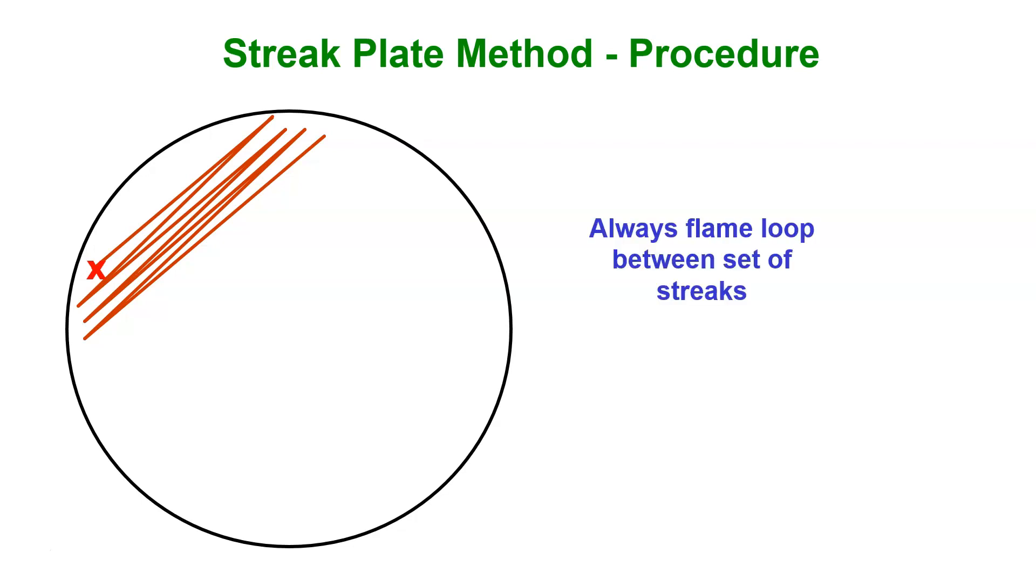When you flame again, it's going to destroy all of the bacteria on the loop. Do not go back and pick up new material. You take your cool loop over.